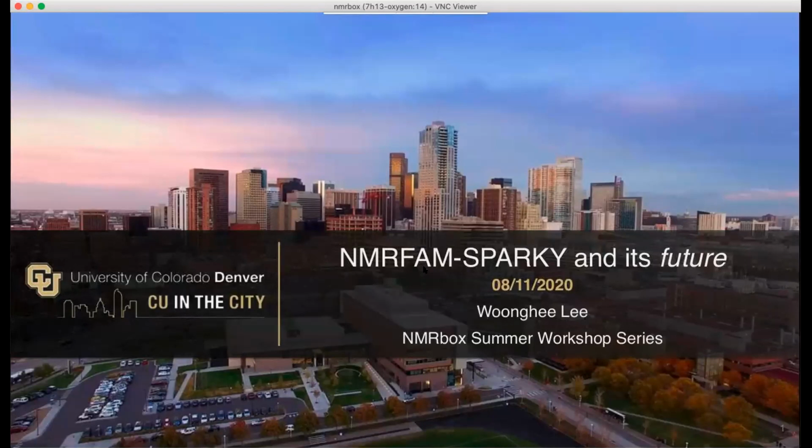I'm really grateful to share my contribution to the biomolecular NMR field. You probably have at least heard about Sparky software and the recent update from NMRFAM that has been rebranded as NMRFAM-SPARKY. And since I have moved to Denver, you might be wondering what's going to happen with Sparky as well. But everything is optimistic, and I'll share my thoughts, and you can comment on that too.